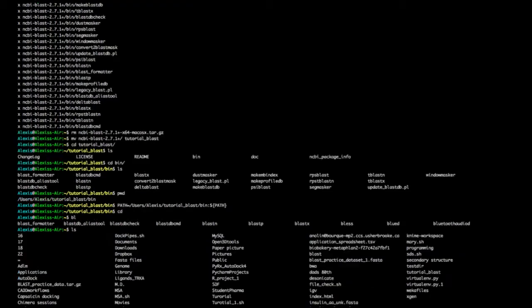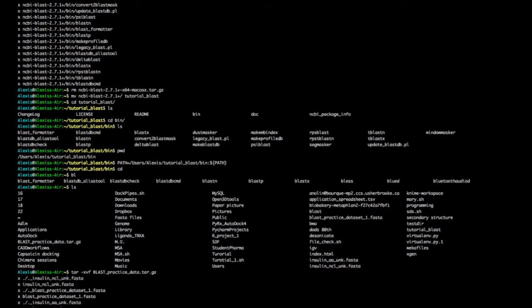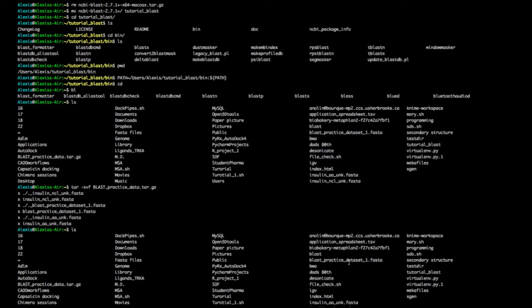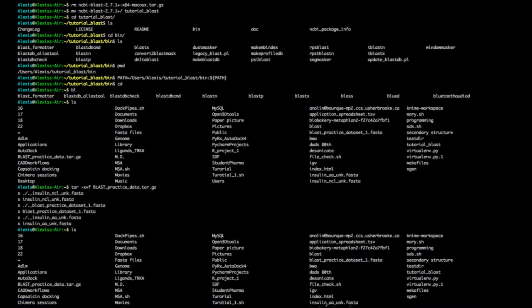Now I have my BLAST practice data here. I'll decompress it by running tar xvf on the BLAST practice data file. After listing the directory, I have a file called 'BLAST practice data set number one FASTA', plus 'insulin_AAA_unknown' and 'insulin_nucleotide_unknown'.